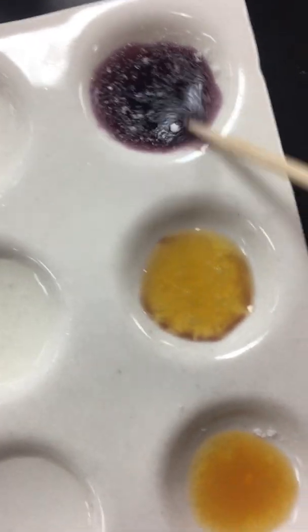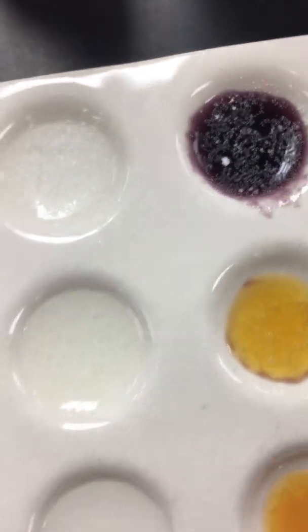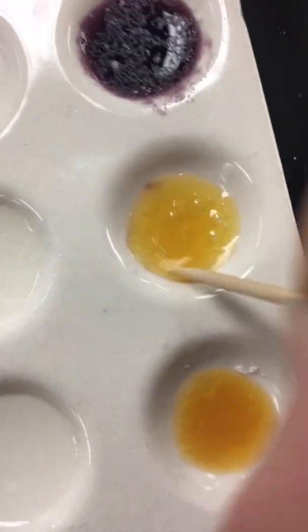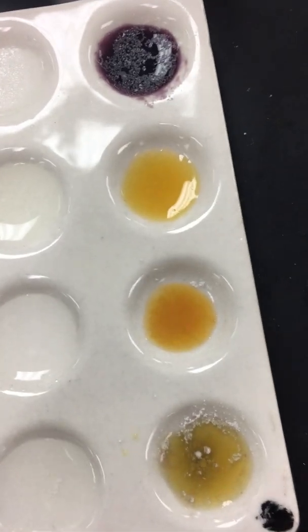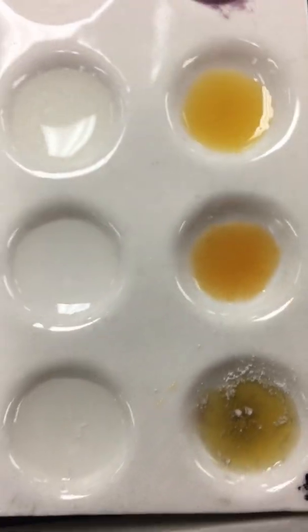Mix up the aspirin. It kind of still floats on top, but turns this kind of dark, deep purple color. And then we have Alka-Seltzer right here. That bubbled up a little bit. Stayed sort of a yellow-orange. Then we have sodium bicarbonate. That turned a darker orange.